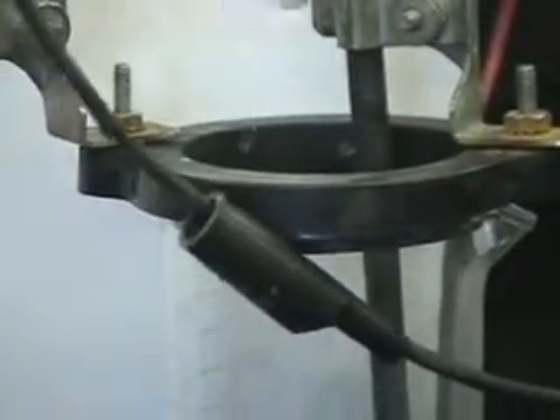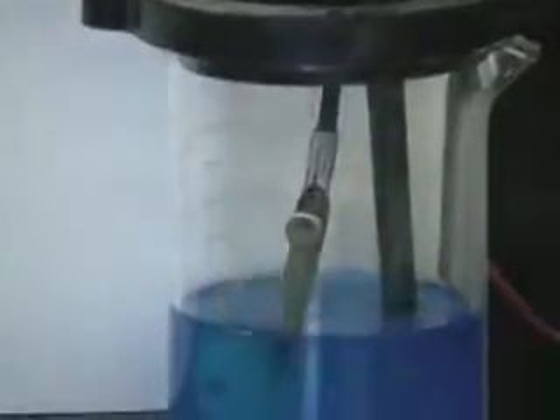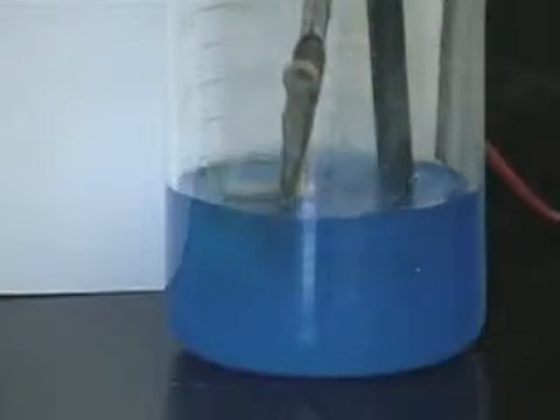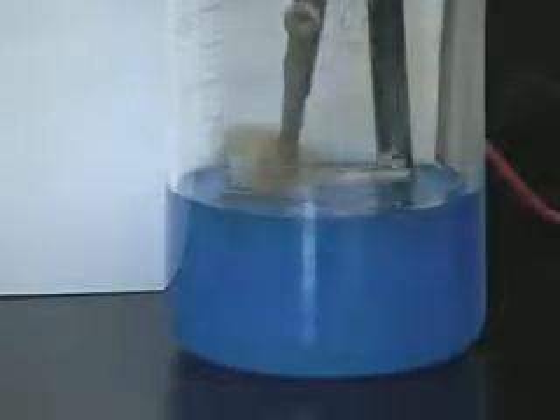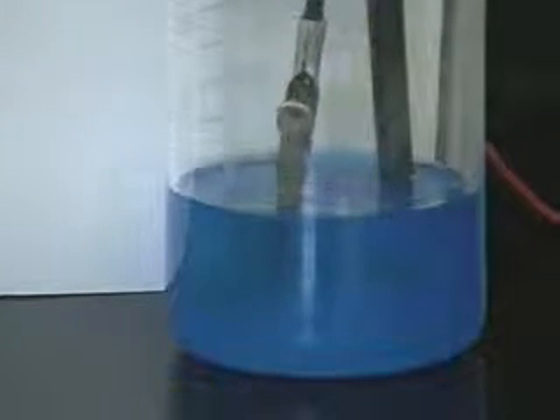Remembering to turn the voltage supply on — and here we go. Let's just remove the cord, and we're just going to dip it a couple times. We'll leave it in there for, oh, ten or so seconds.